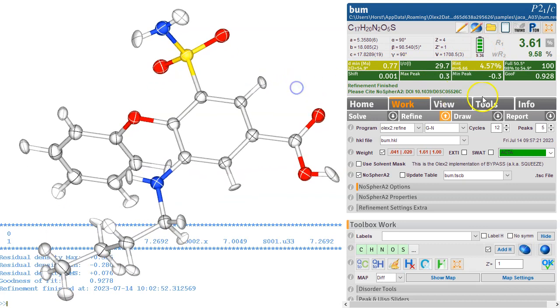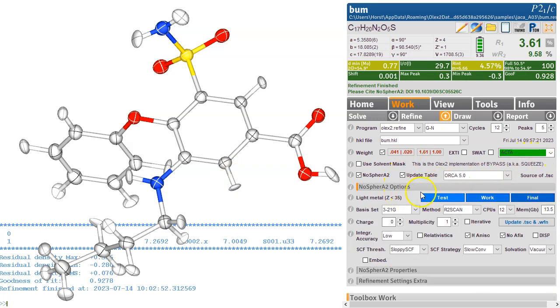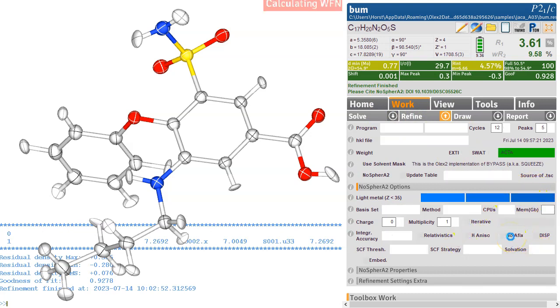And now these hydrogens, now we need to do it again, because now we have a new model. The hydrogen atoms moved out, they're now actually in the neutron positions, that's the real positions where they are. So we need to update that table. And just for this demo, I'm going to go for the second set. So we take the work settings, we're taking a more expensive basis set. And we're only doing it once as well. But really, what you want to do is go then to final and repeat the calculation until it's all completely settled. So that's the idea to get these form factors right.